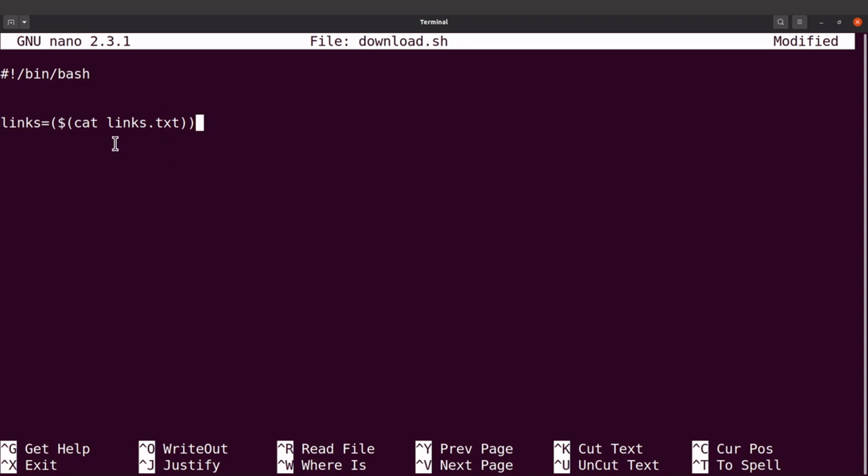So what I'm doing here is that the contents, everything here, the dollar here tells bash that the outputs of this command should be placed in an array. We have another parenthesis here, so this means that the output should be placed in a bash array.